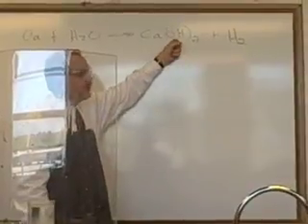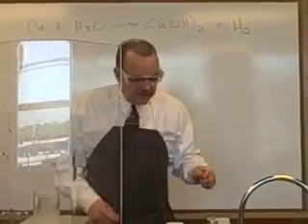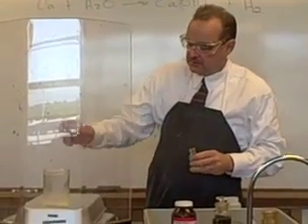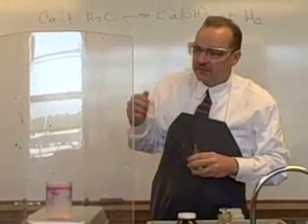It's the first time you've seen a base formula probably in this class, but anything with an OH at the end is a base. If it's a base, then what should happen when I put the phenolphthalein in? Pink. All right, so we have a base that was produced.